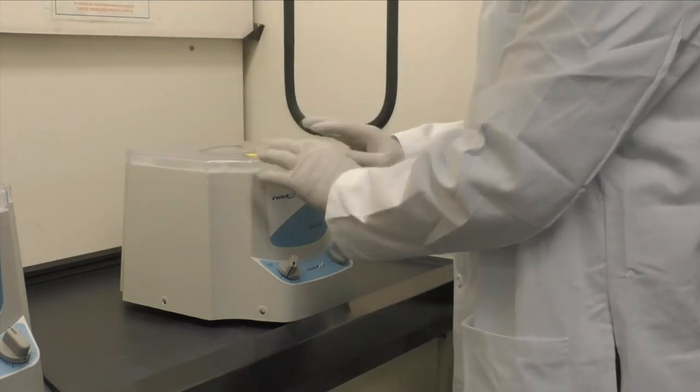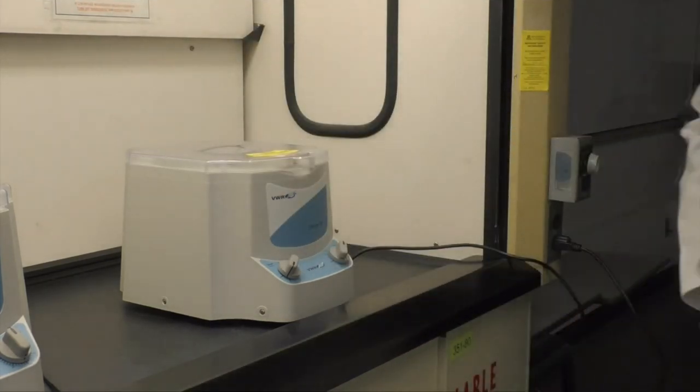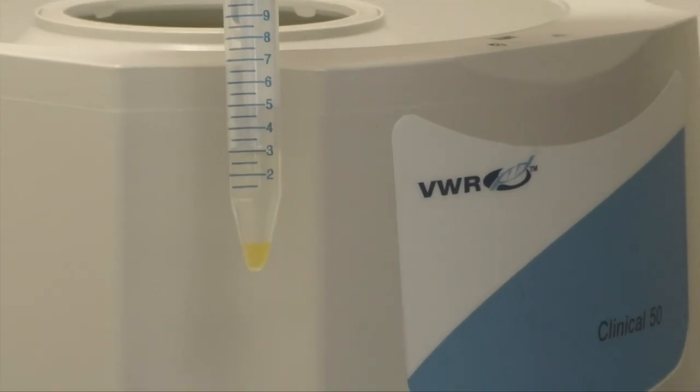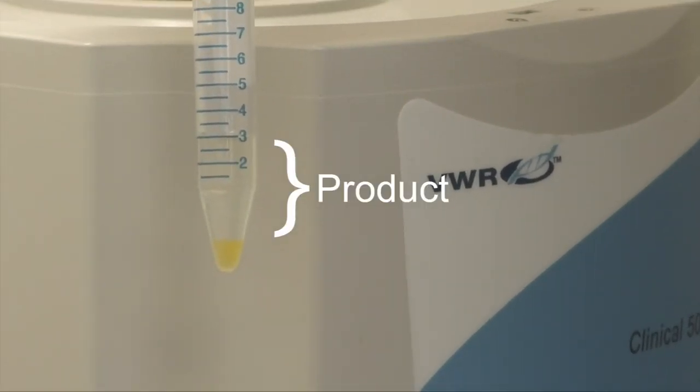After centrifuging, you should have two layers. The top layer is your fatty acid methyl ester. The bottom layer is waste.